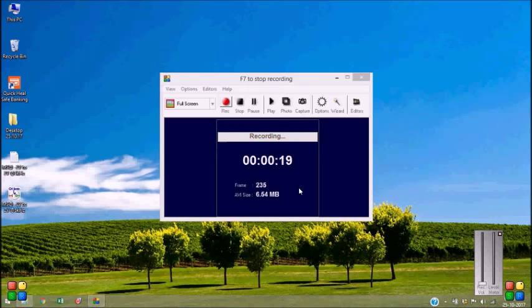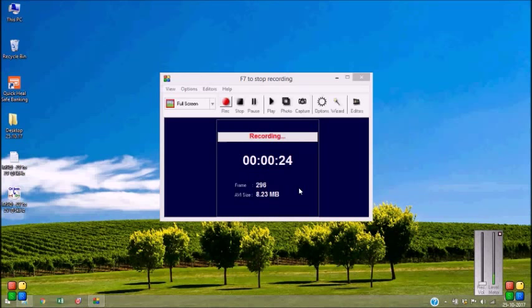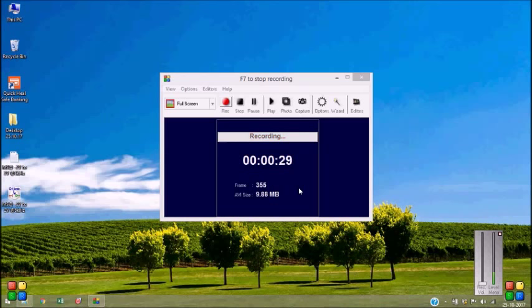Today, I shall show you how to plot the Mott-Schottky plot using the data obtained from the CH instruments electrochemical workstation. So let's begin.